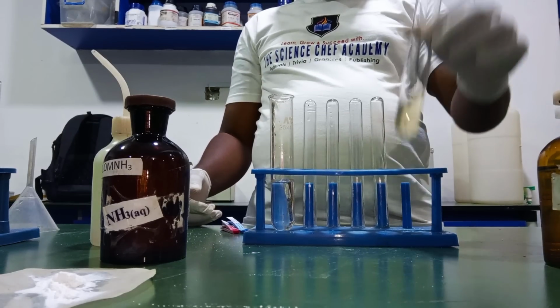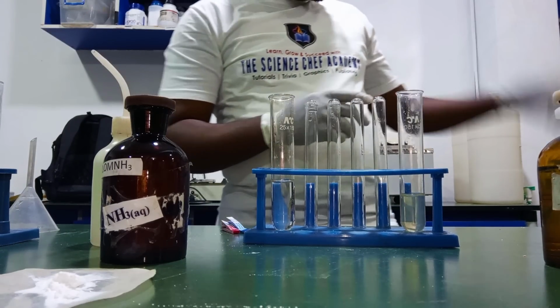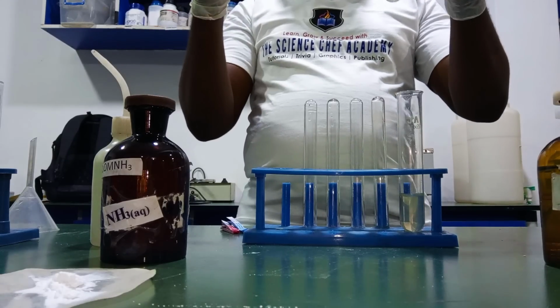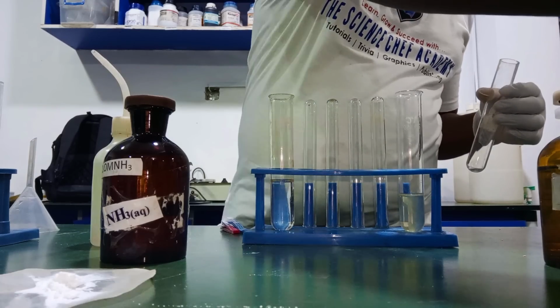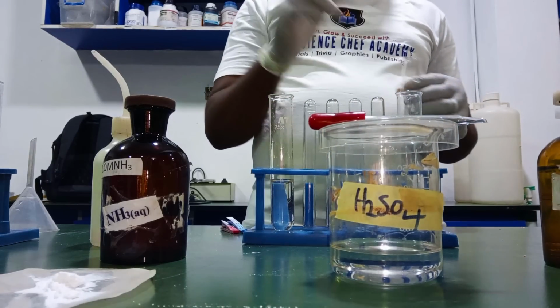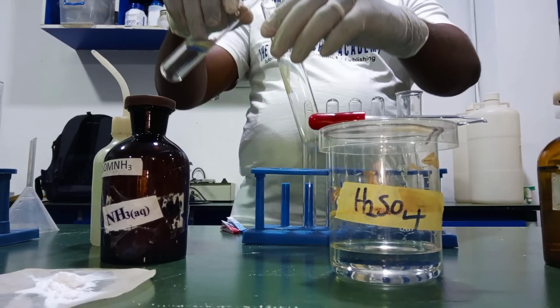So having prepared an iron(II) sulfate solution, we're now going to carry out the brown ring test on the filtrate. That's to test for the nitrate ion, using the concentrated H2SO4 and the freshly prepared FeSO4. So this is the filtrate. Remember, these are filtrate.